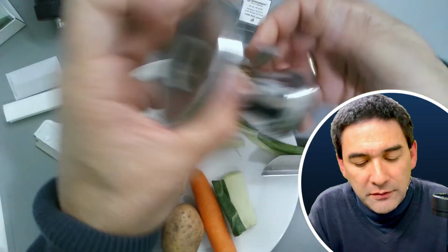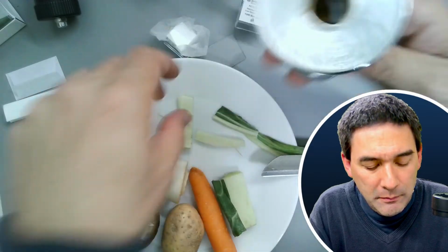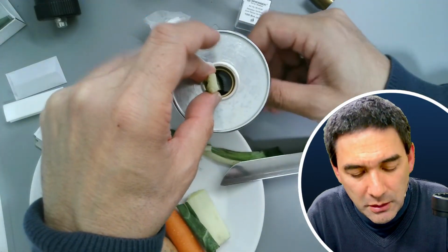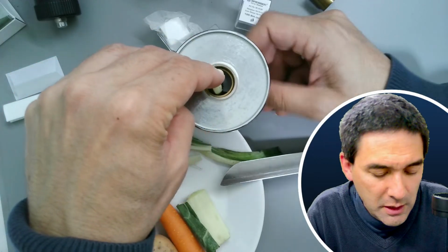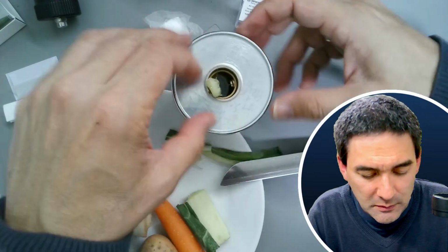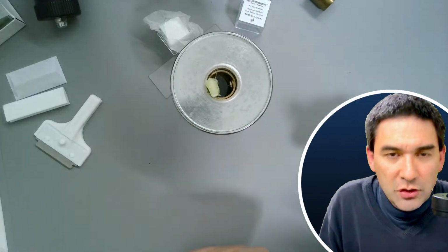The first thing that you have to do is kind of lower the whole thing. Yeah, so it's moving down, as you can see. Then I put it in like this. I close it, maybe I should go a little bit with the shape here. Yeah, let's try it like this. Okay, so I clamp it in. It's reasonably stable.